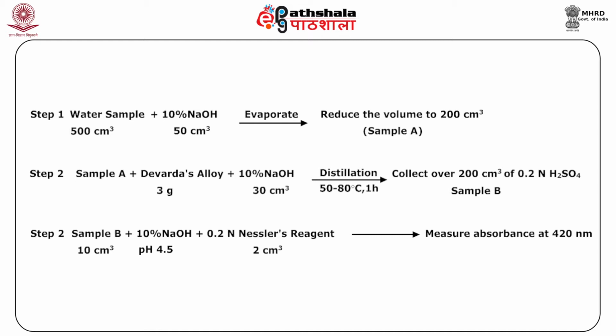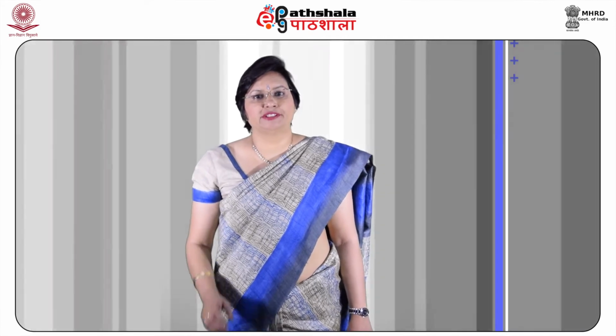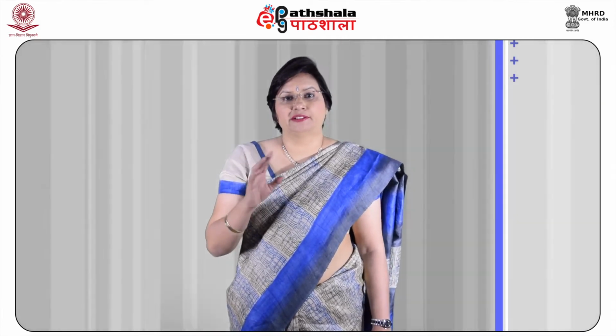The mixture is distilled at 50 to 80 degrees centigrade for 1 hour, after which the receiver is disconnected and the volume of the solution in the receiver is made up to 250 cm3. An aliquot of 5 to 10 cm3 is taken in a 50 cm3 volumetric flask and the pH adjusted to 4.5. Further, 2 cm3 of Nessler's reagent is added and the absorbance is measured at 420 nanometers, as we have done earlier for the ammonia estimation. This method is valid for nitrate concentration greater than 0.5 ppm but less than 5 ppm.